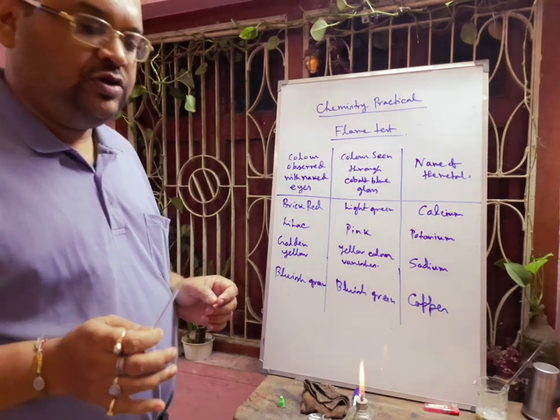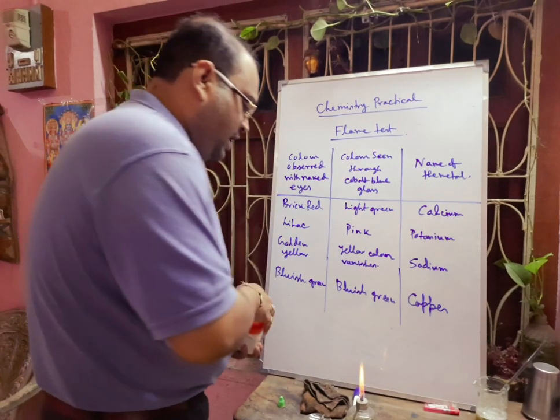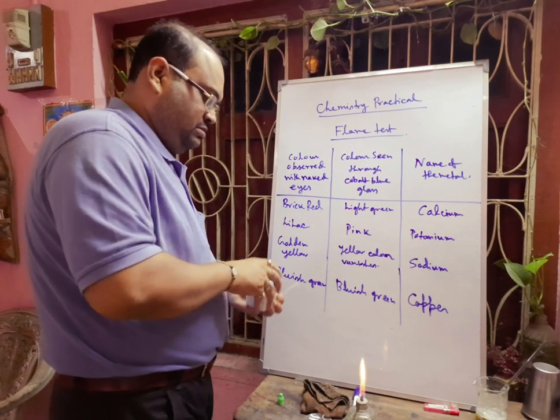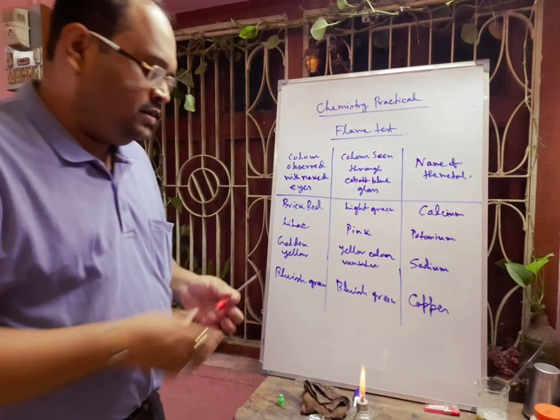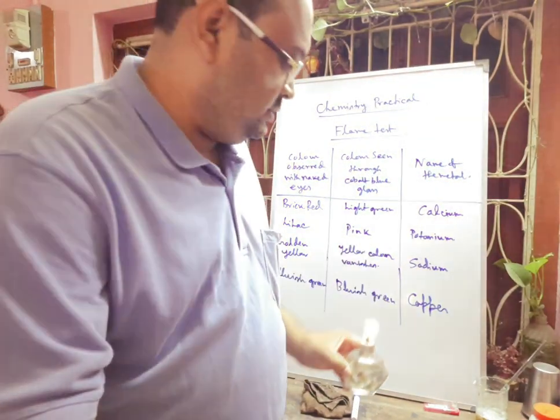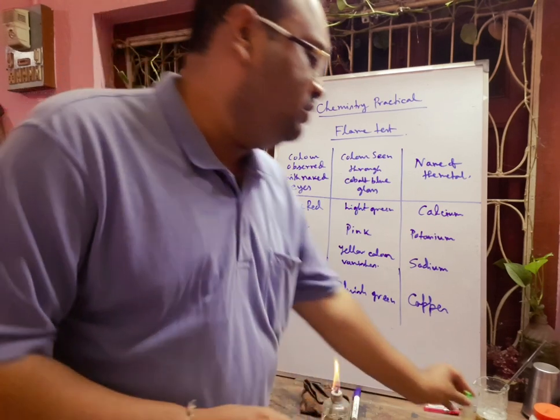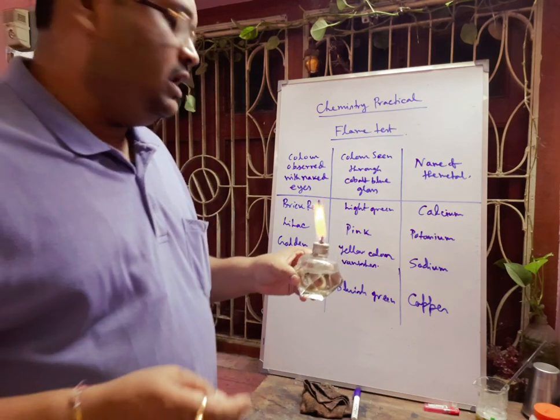Next, we will go for sodium ions. Again, we have to take some sodium salt — we have taken sodium carbonate — inside this HCl, and we heat it inside the spirit lamp. Definitely it will show you some golden color. If you observe through double blue cobalt glass, it will absorb the yellow color and the yellow color will vanish.